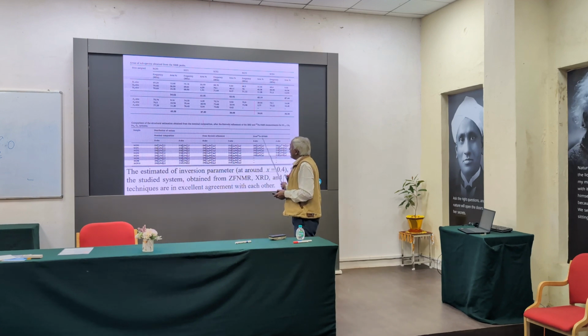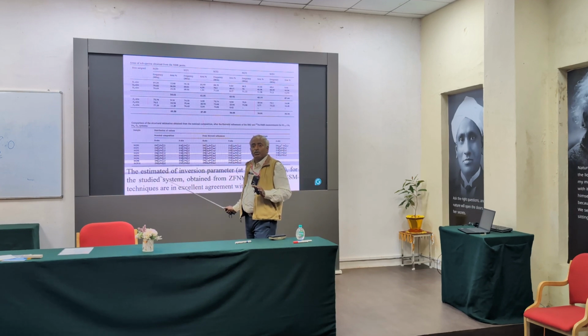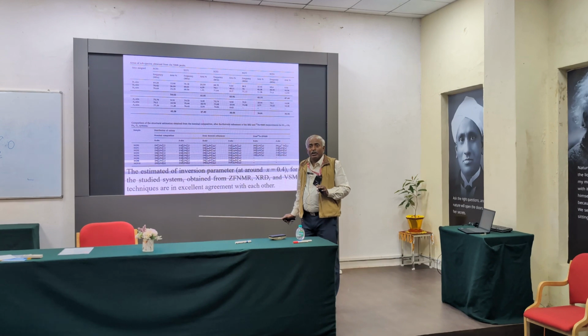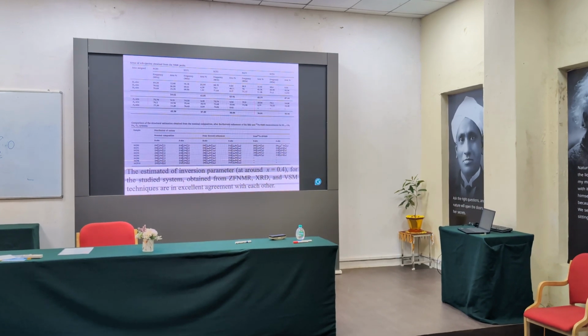And then with XRD, with Rietveld, and in the latest papers we did it with Raman studies also. I have not touched upon the Raman studies, whatever work we did. In our recent submitted paper on FTIR also, we try to connect it to the same system, the nickel cadmium system. I have not talked about that because it is not yet published. The same studies can be done with Mossbauer. With Mossbauer also we get all this, the way I got different peaks.